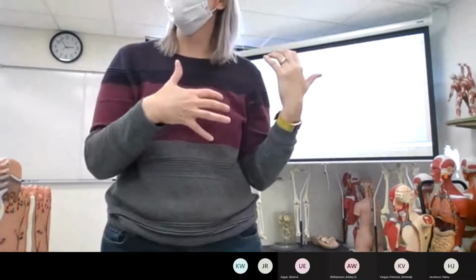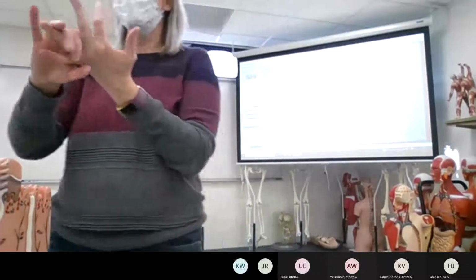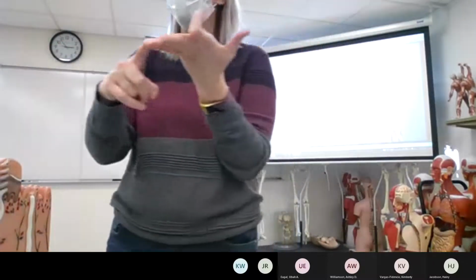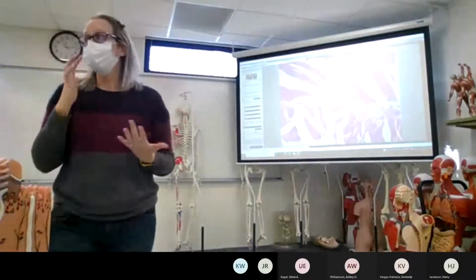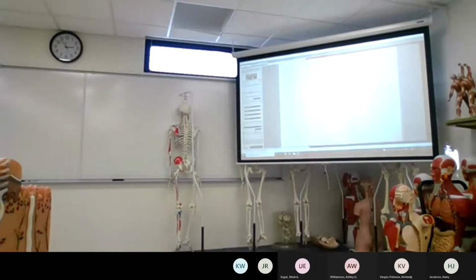These are contracting cells under involuntary control. They can be told to contract by hormones, local cell factors, the nervous system, and automatically, just intrinsically. We tend to find them running in the two directions together. No striations.